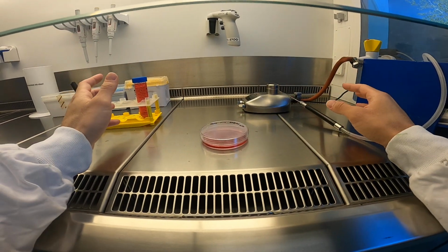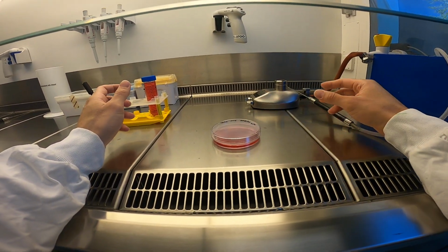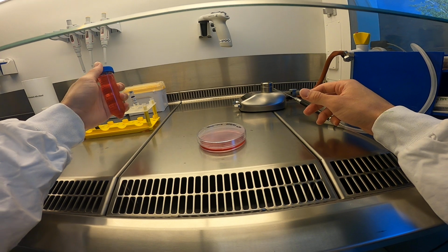So our workspace is already clean. You do not need to clean the plate with ethanol. However, you do need to clean the tube with ethanol before introducing it in the laminar flow cabinet. I've already done that.